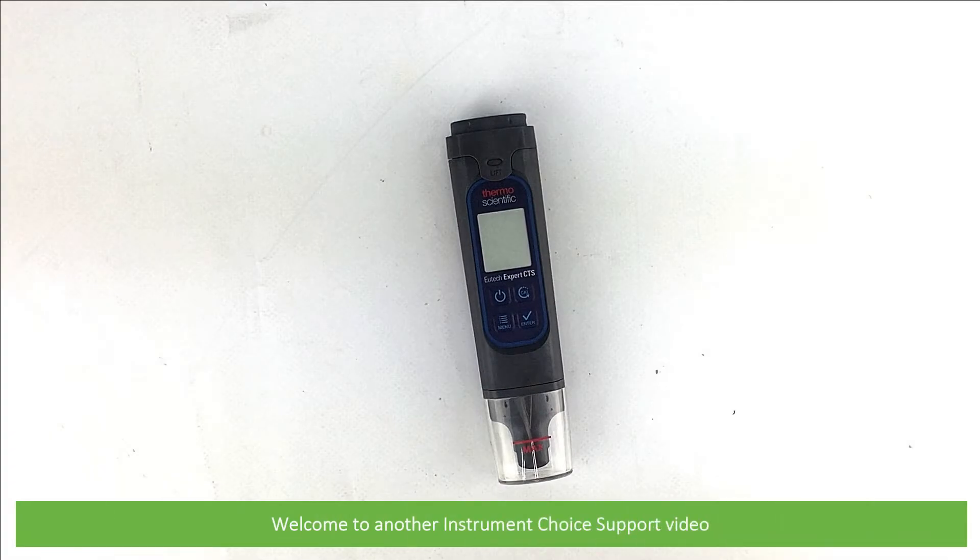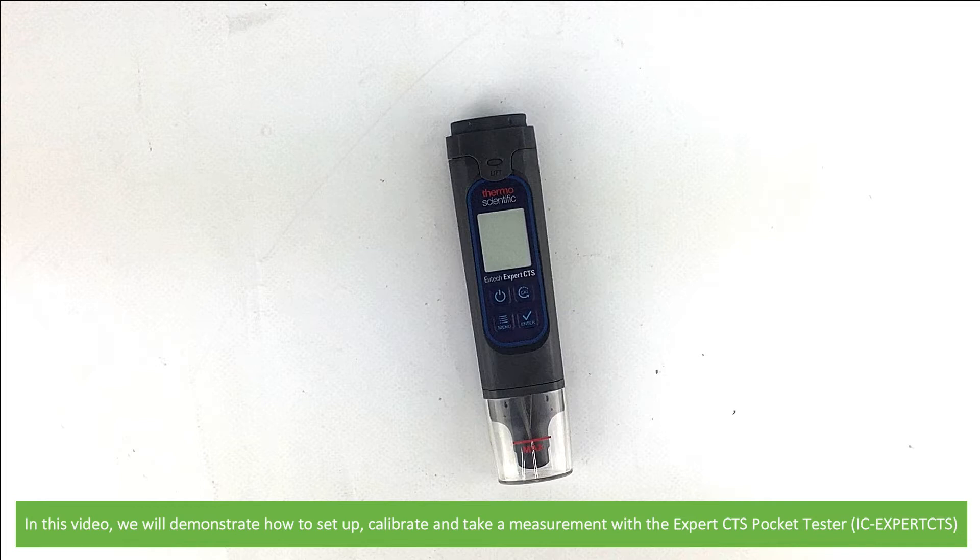Hi and welcome to another Instrument Choice support video. In this video we'll demonstrate how to set up, calibrate and take a measurement with the Expert CTS pocket tester.